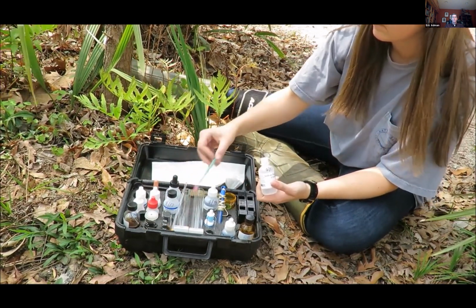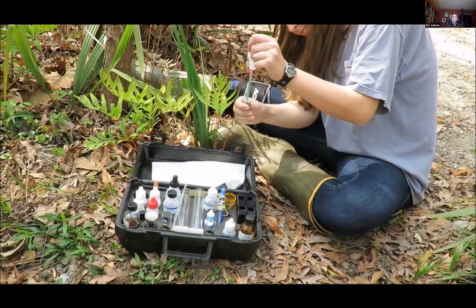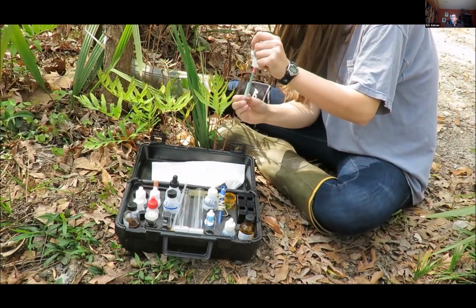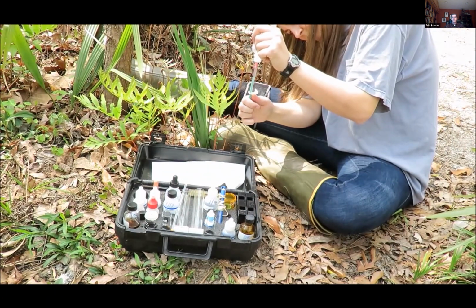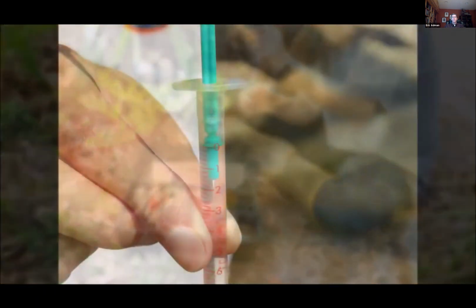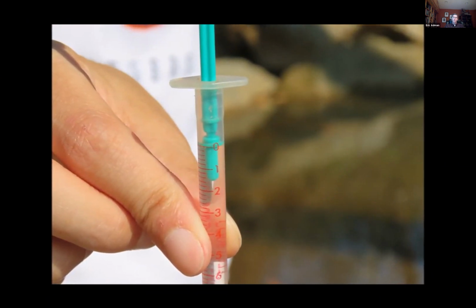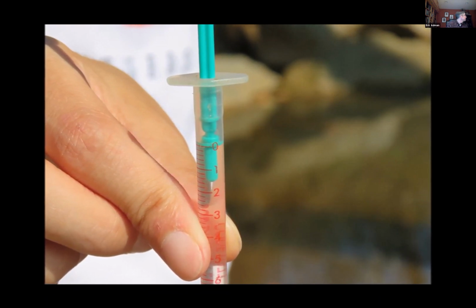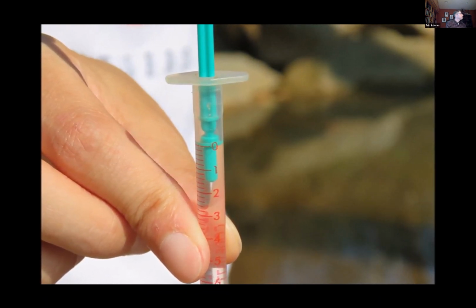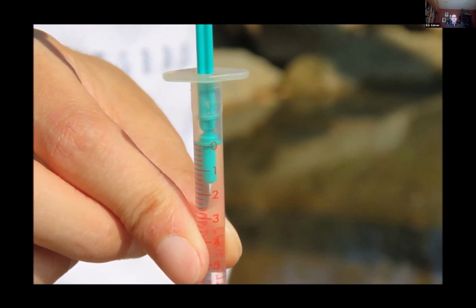Locate the direct reading titrator and the sodium thiosulfate bottle in your kit. Depress the plunger on the titrator and insert into the hole in the top of the sodium thiosulfate bottle. Invert both the bottle and the titrator. Pull the plunger on the titrator until the large ring on the plunger is opposite the 0 line on the scale. Make sure there are no air bubbles in the titrator. Bubbles may be removed by moving the plunger up and down while the bottle of sodium thiosulfate is inverted.